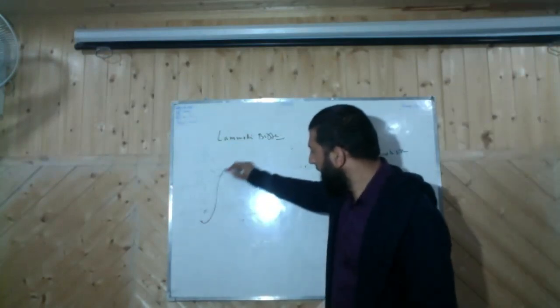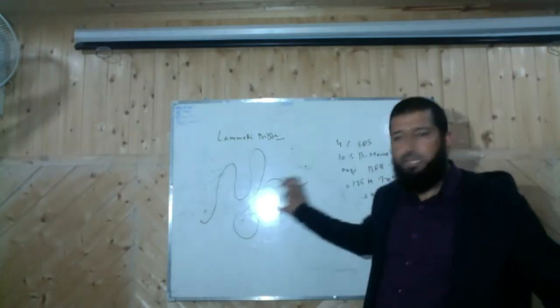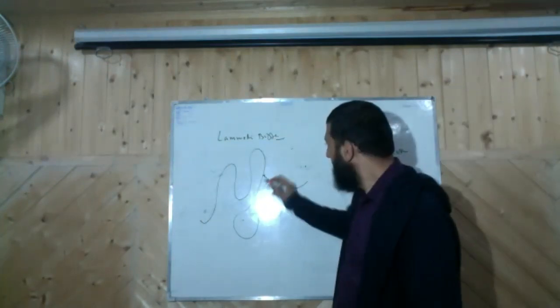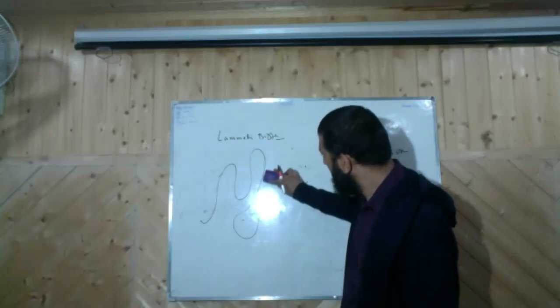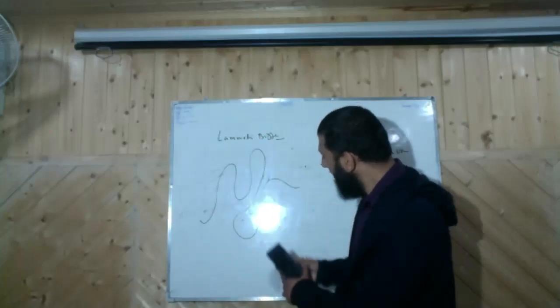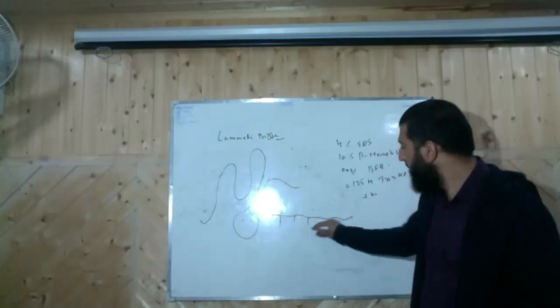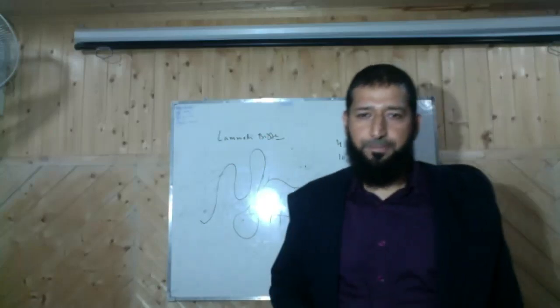So you know that the protein is a 3-dimensional structure, and this SDS helps in breaking all the bonds that make the tertiary structure of protein. And then beta mercaptoethanol is a reducing agent. If there are disulfide bridges, it will break these disulfide bridges. So that at the end you have a linear protein, and your SDS molecules are bound at regular intervals to it, so that they give a uniform negative charge to the protein, right?